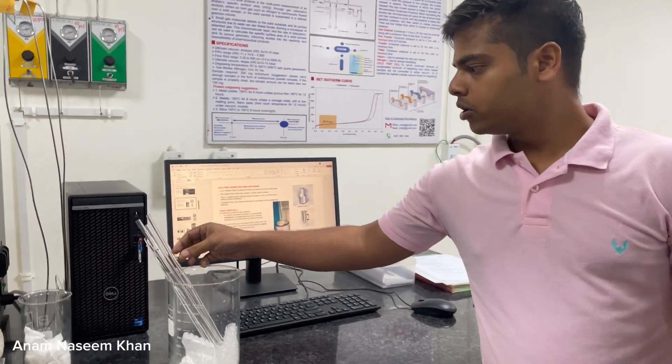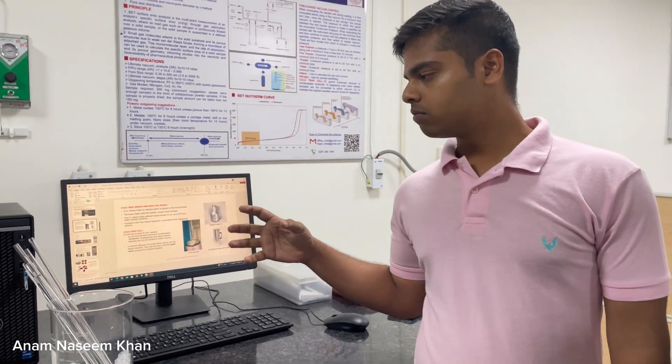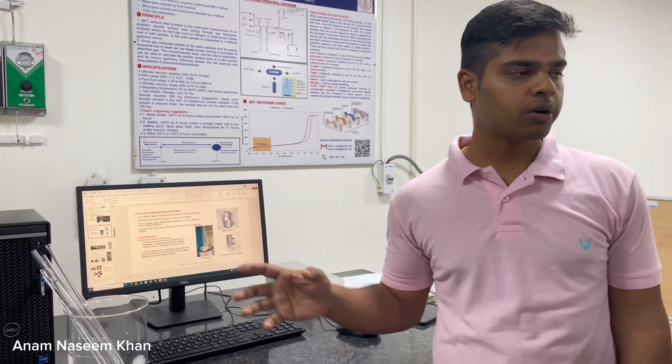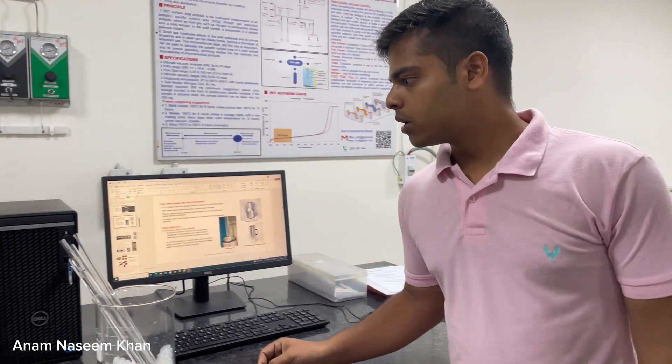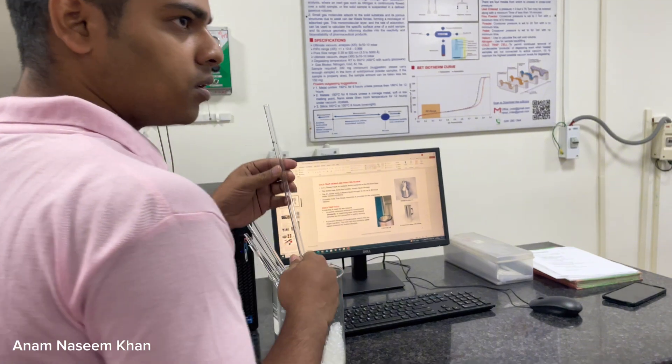You must use a properly dried sample, and then you have to weigh it three times. Weight is very crucial for the measurement of surface area and pore size. After that, you put your sample into the sample rod.